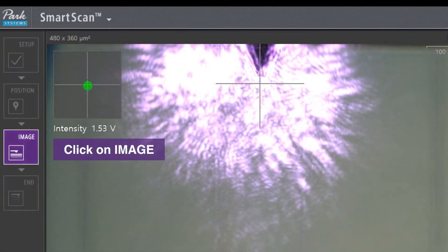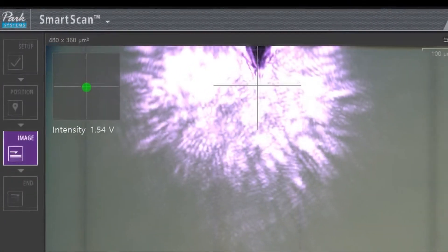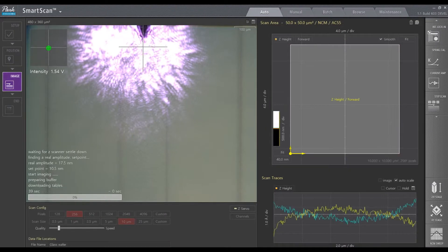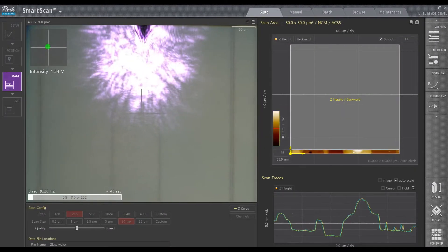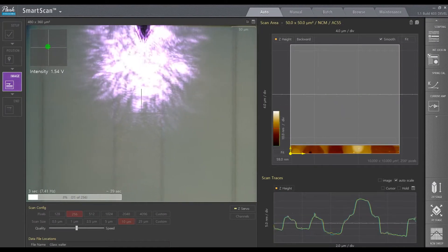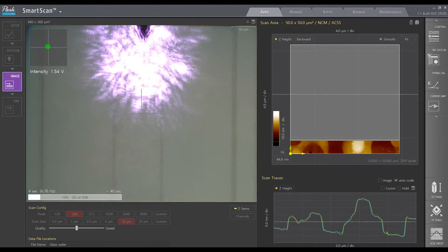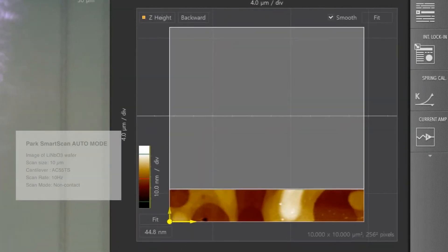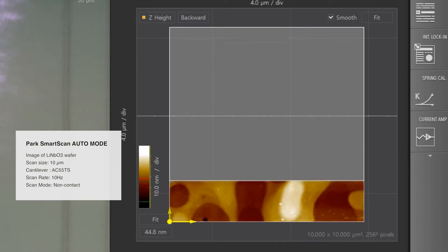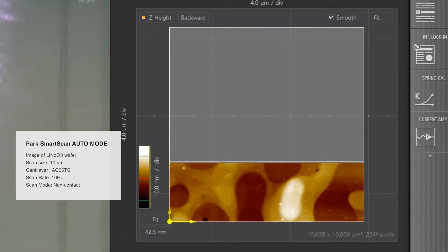Now, just click on Image, and the imaging will begin. As you can see, ParkSmartScan is measuring the morphology of the top surface of the lithium niobate wafer. Lithium niobate is attracting attention as a key component of memory devices used in optical information processing.